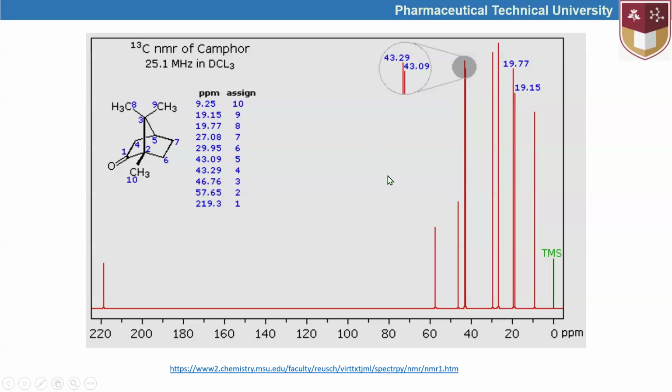I was referring to hydrogen NMR results. I'm really sorry. So they are close to each other. That's why I didn't understand this point as well. And that's why we see similarity between them, and they are close to each other as well.